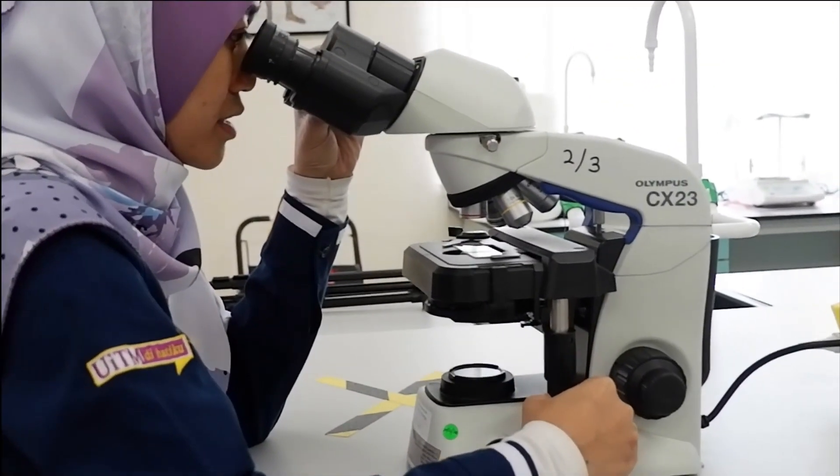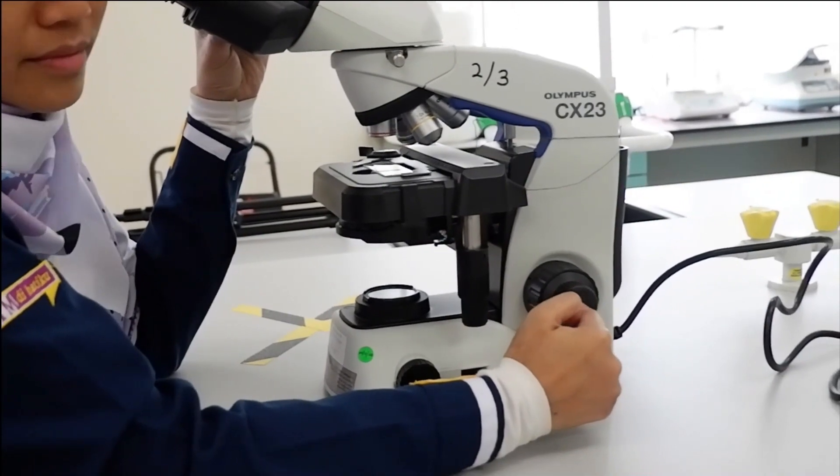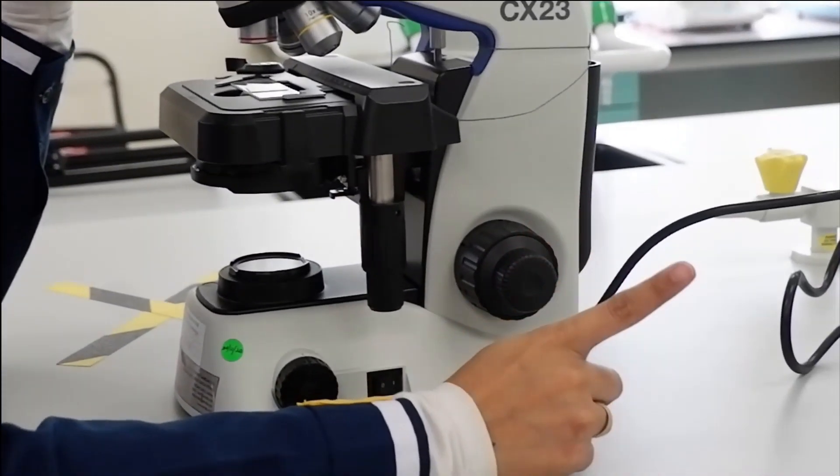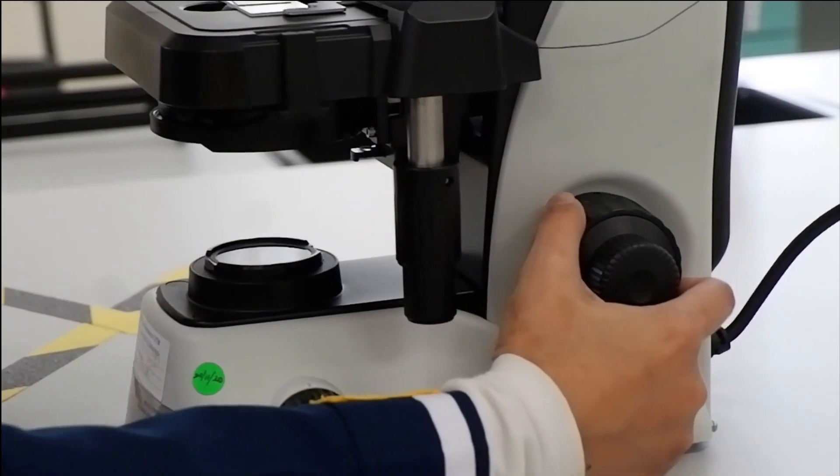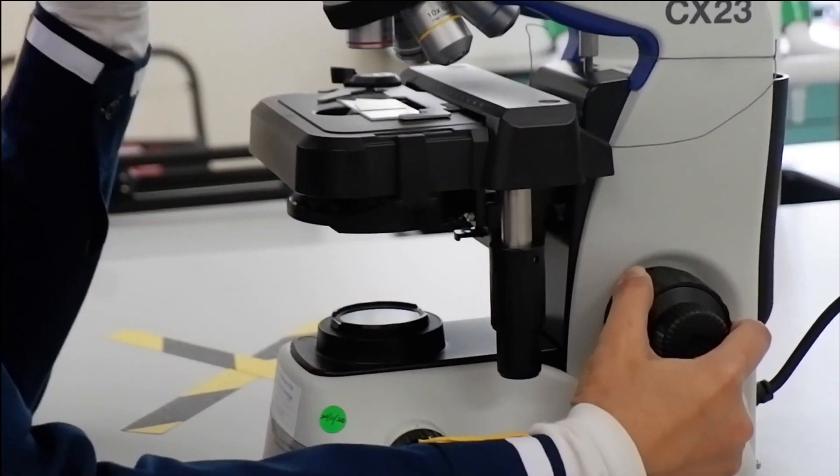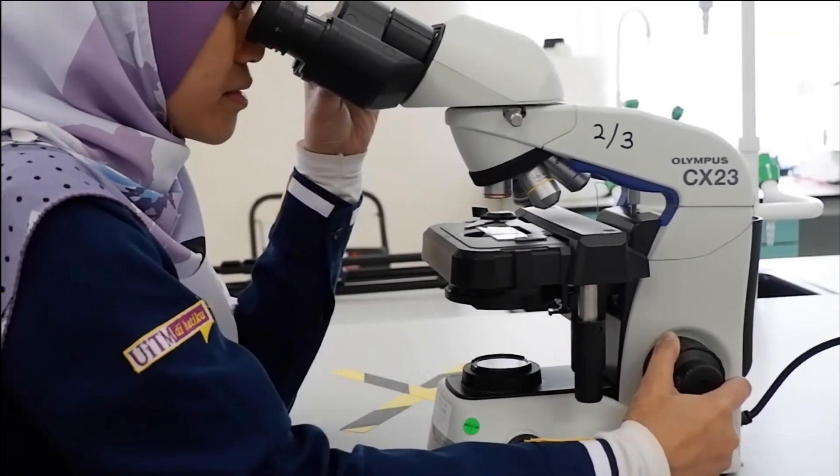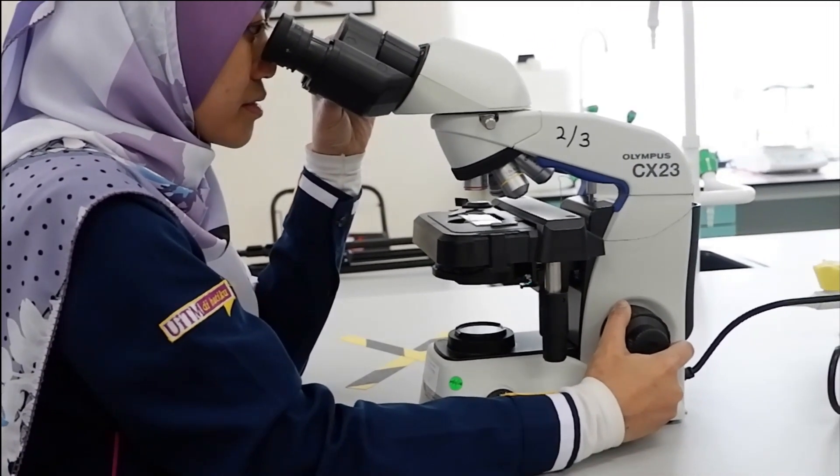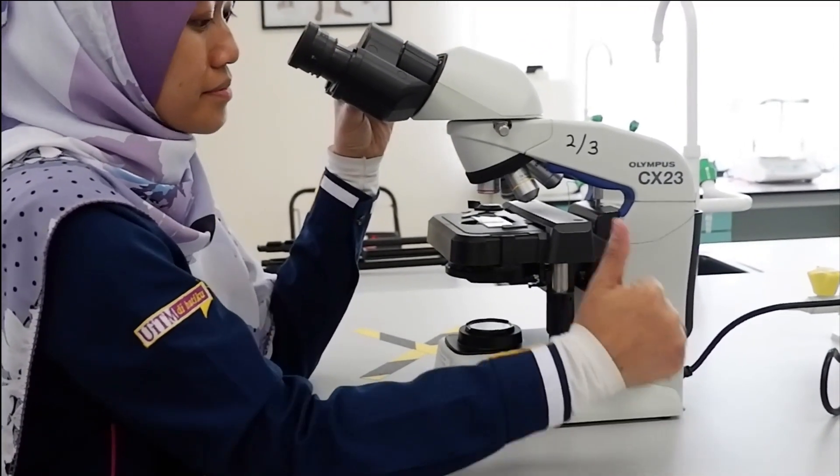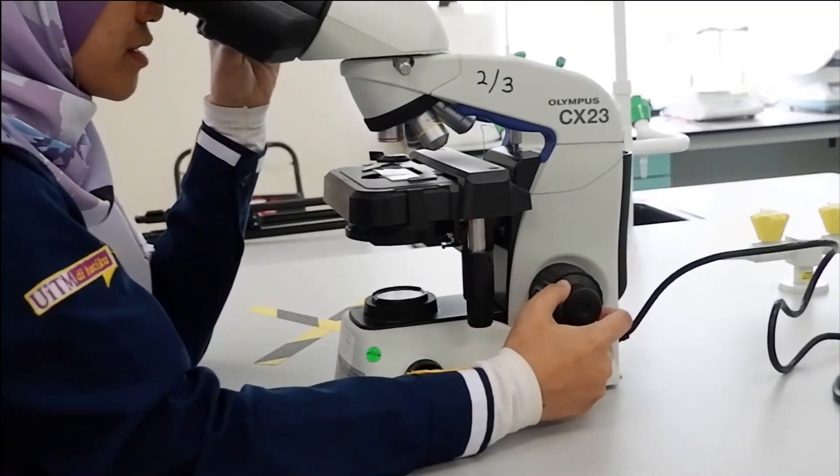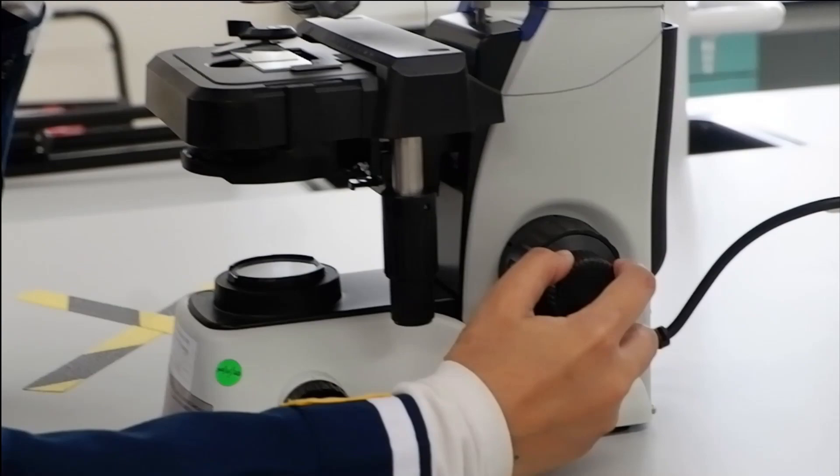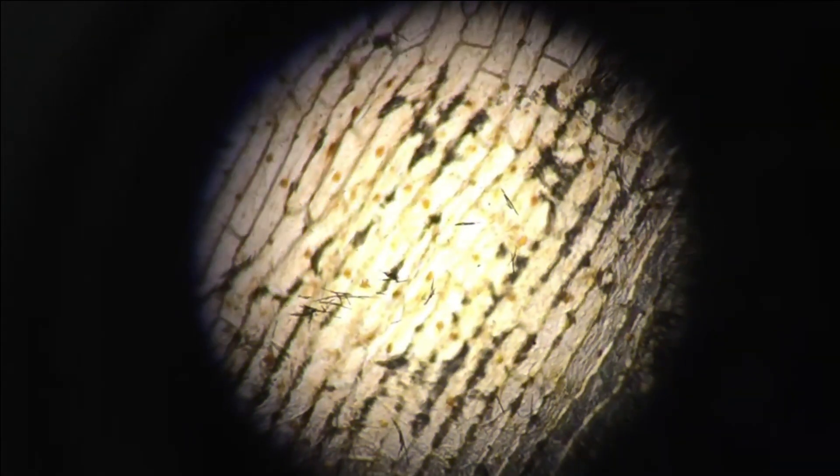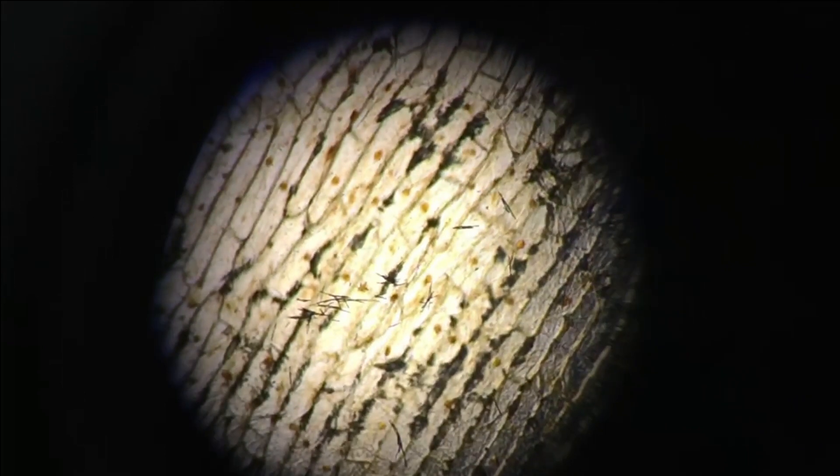Look through the eyepiece and make sure not to use fine focus knob at this moment. Move the coarse knob until the image comes into focus. And then you can use the fine focus knob to make sure that the image is clearer. This is what you will see under the microscope.